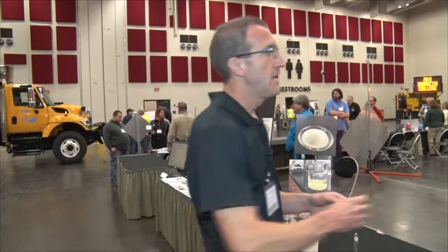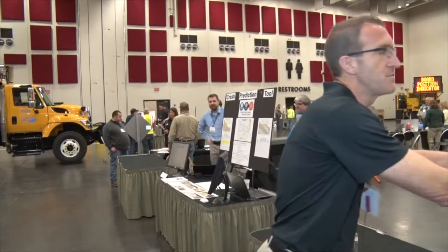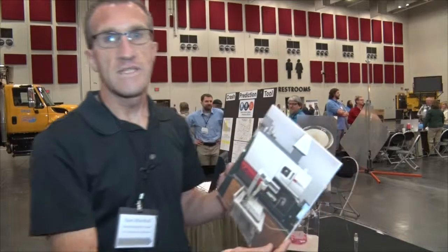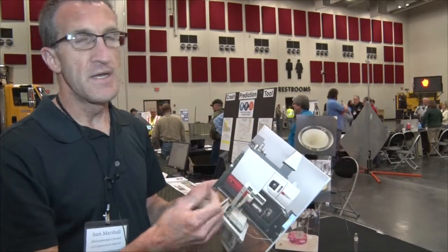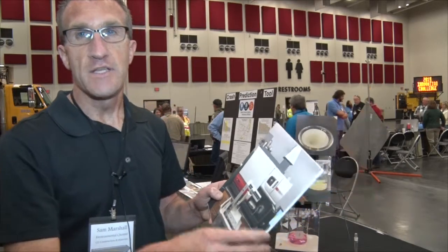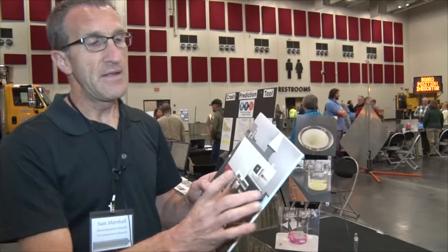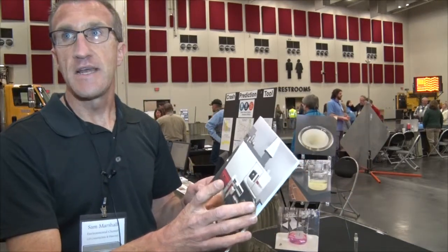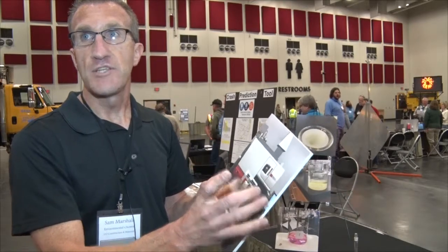From there, I transfer it to an inductively coupled plasma emission spectrometer. Once the sample is in solution, I can use this emission spectrometer to determine silica, aluminum, iron, phosphorus, and titanium, because those are minor elements in bauxite. And I have calibration lines that are bracketed that will differentiate how much is in there.